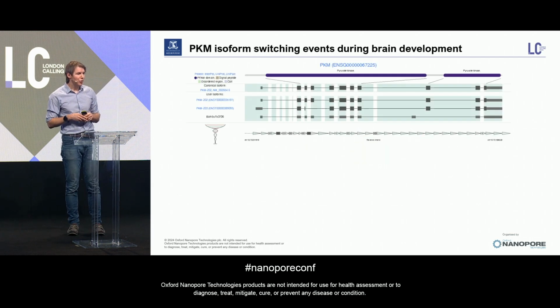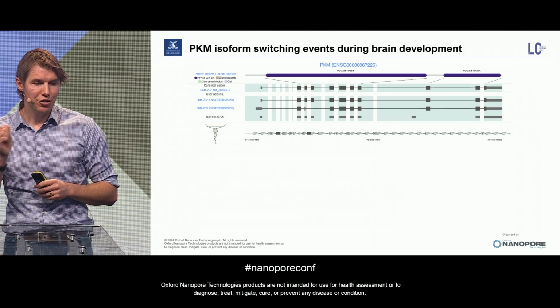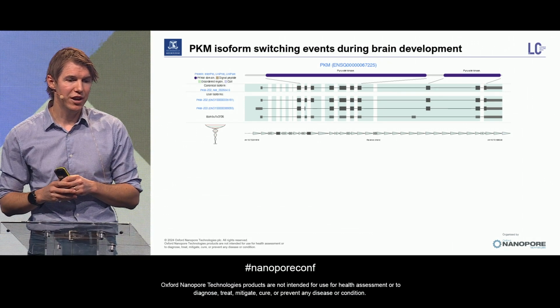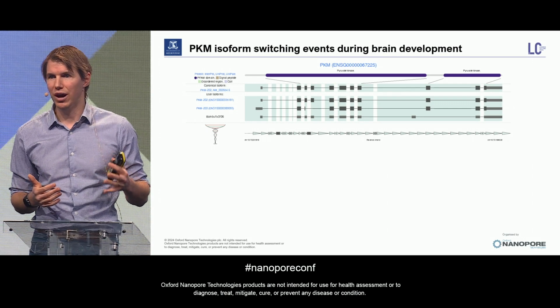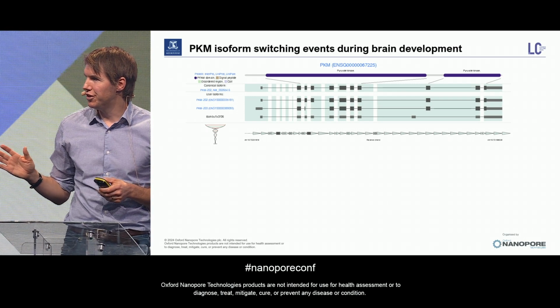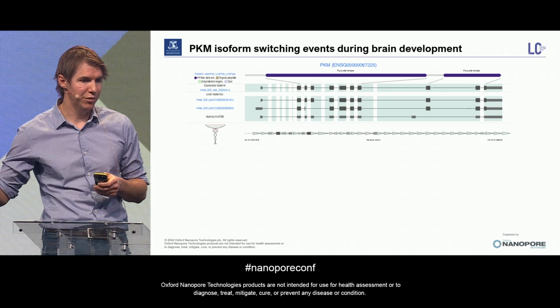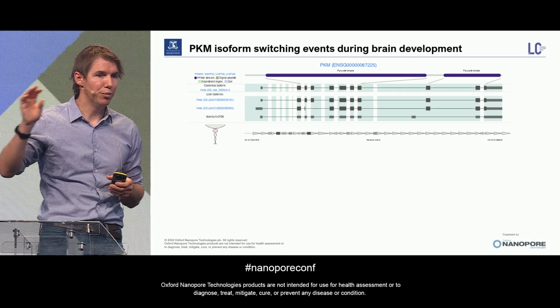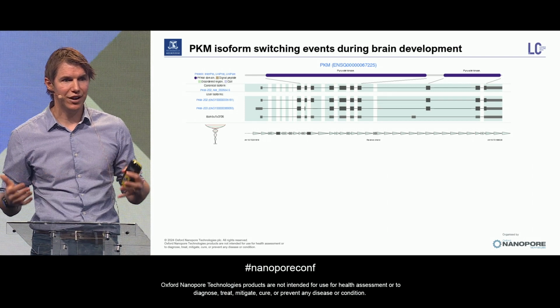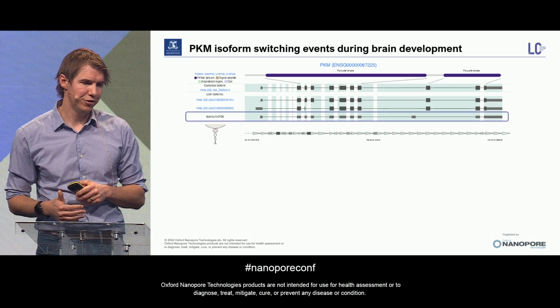However, when you go and do isoforms, you see something that looks a little bit different. Now, I'm just going to take a second to explain this image here. This is from a tool called Isoviz, and it allows you to visualize both your isoforms and their expression. Similar to a UCSC genome browser, all of the black boxes are exons, all of the lines joining them are introns, and up the top in purple are the protein domains which are mapped to each exon. So you can understand how isoforms differ both in their exonic content and in their protein domains.